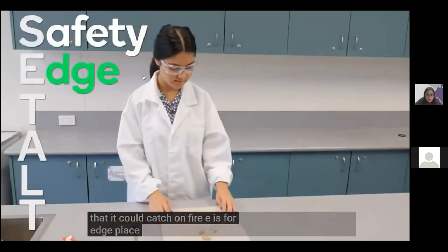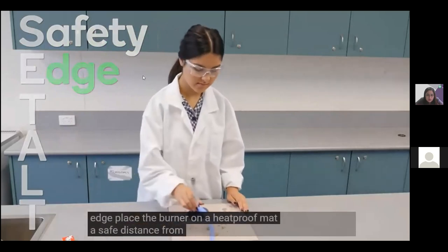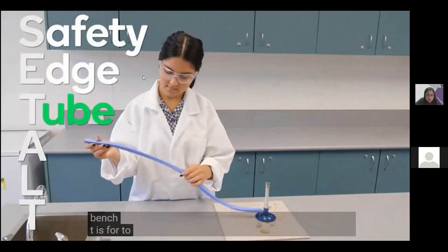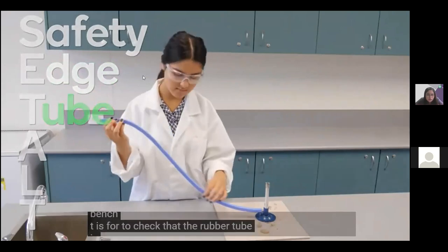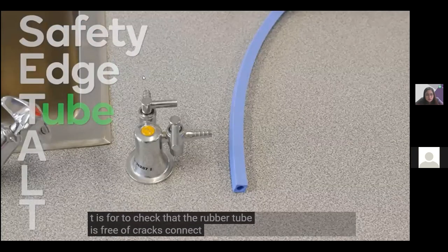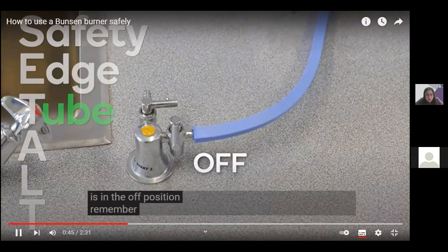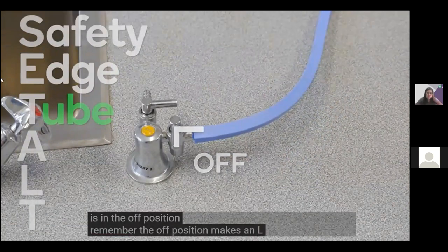E is for edge. Place the burner on a heatproof mat a safe distance from the edge of the bench. T is for tube. Check that the rubber tube is free of cracks and connect it firmly to the gas tap. Make sure the tap is in the off position — the off position makes an L shape.